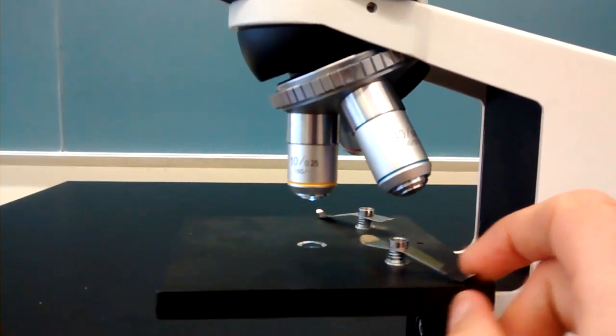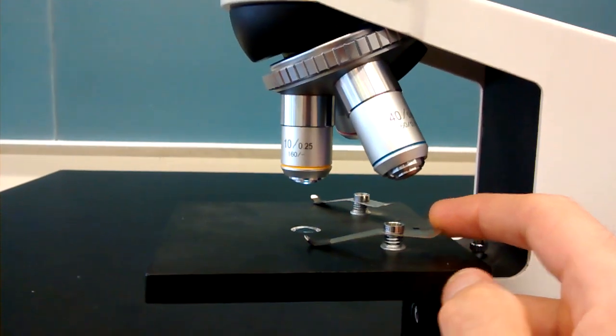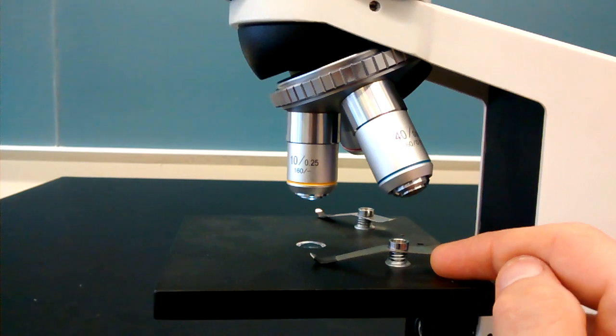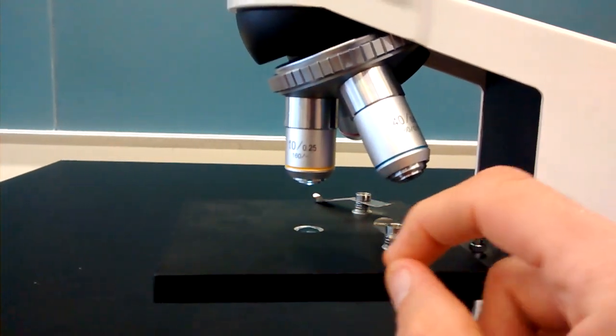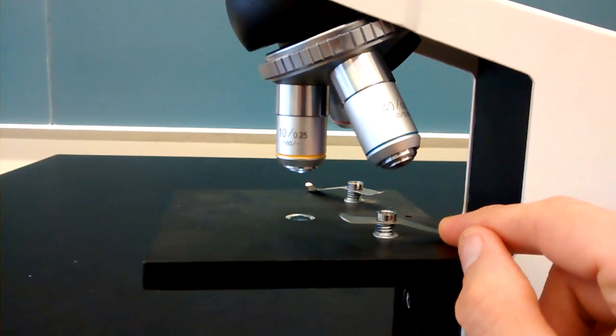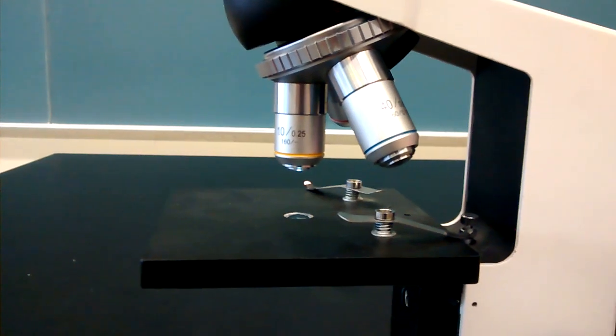And there are two stage clips that can help to hold your slide into place. We typically aren't going to use these because many times we're going to be looking around on a slide. So I just turn these around backward. You're not going to be moving your microscope when using it. So your slide isn't going to be moving around on you.